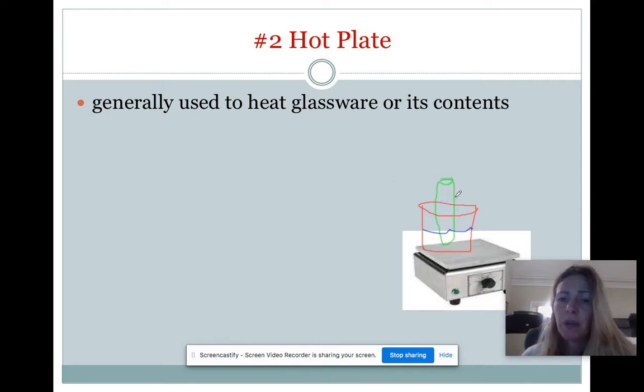That way, when anything comes out, or if vapors do come out, they're not going to come towards your eyes. Also, if you're standing right here, you should be wearing your little goggles. That's a beautiful drawing. So you're going to be wearing your goggles, and the test tube will be pointing away from you. Okay, really, really important safety tip.